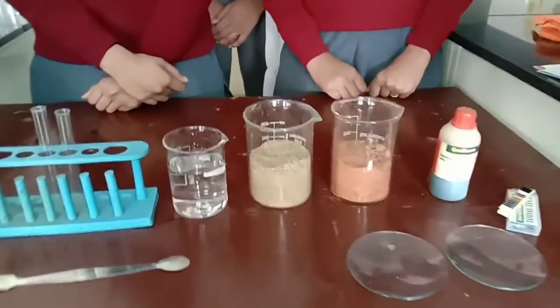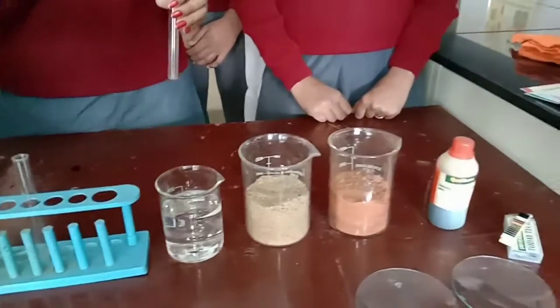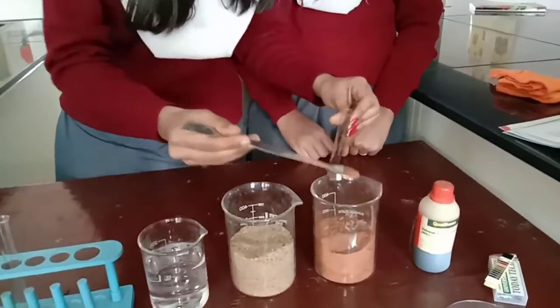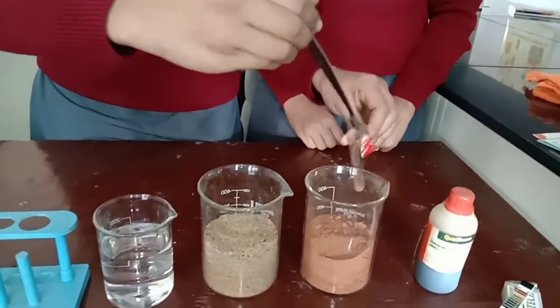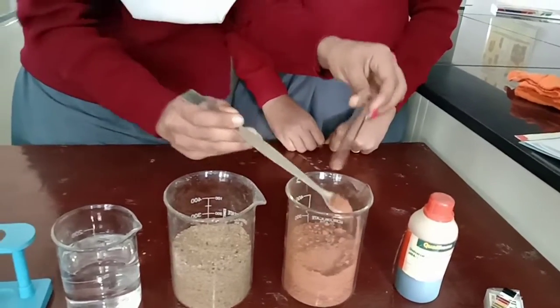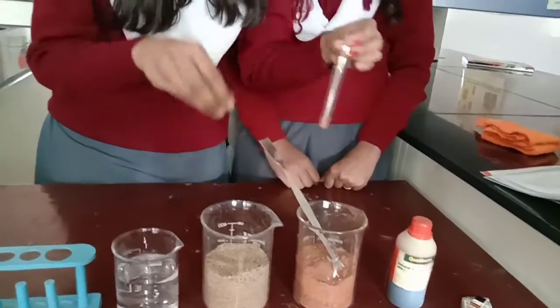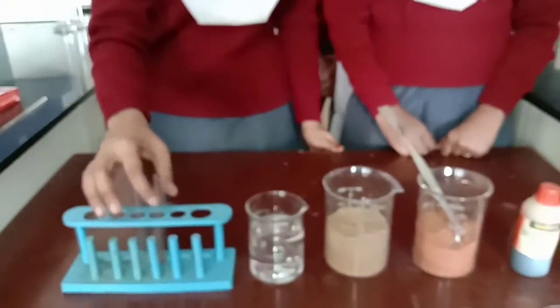If we talk about the principle, pH stands for power of hydrogen ion. It is defined as the negative logarithm of the activity of hydrogen ions in a solution. Soil pH is a measure of the acidity or basicity of a soil. The fertility of soil depends upon the pH of the soil. Acid soil has pH below 7 and alkaline soil has a pH above 7.